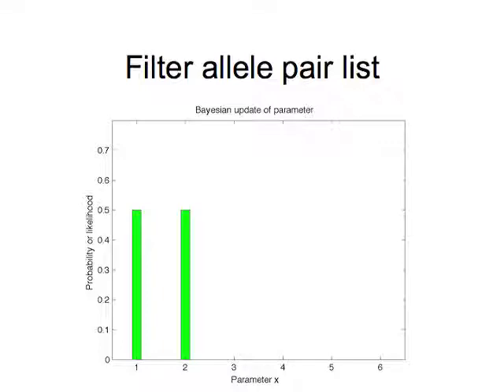Other methods, such as obligate allele methods that consider the victim, or quantitative methods that rule out possibilities based on peak heights, filter this list of all possible allele pairs, and so their likelihood functions have fewer candidate allele pairs for the inferred evidence genotype on that allele list. So here we see perhaps one of the candidates has been removed, and we're left with 2, each given a higher likelihood, and the allele pair that has been removed from the list is given no likelihood at all.